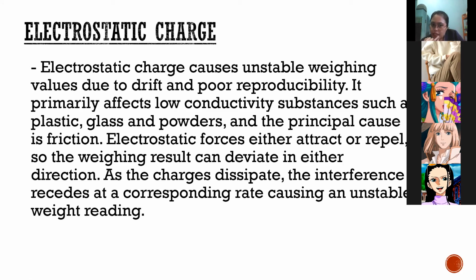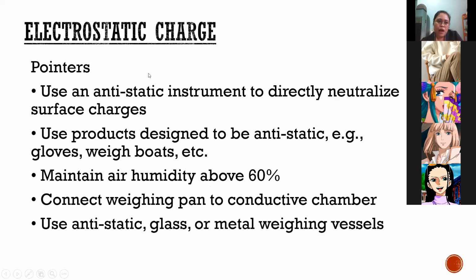Depende kung mag-attract siya or mag-repel, basta magkaroon gihapon siya og interference or error during weighing. Therefore, it is important to use materials nga dili reactive when it comes to charge. Kasi after rubbing, mawala raman tong charge, and then as the charge dissipates, mag-cause na siya og instability sa atong weighing.